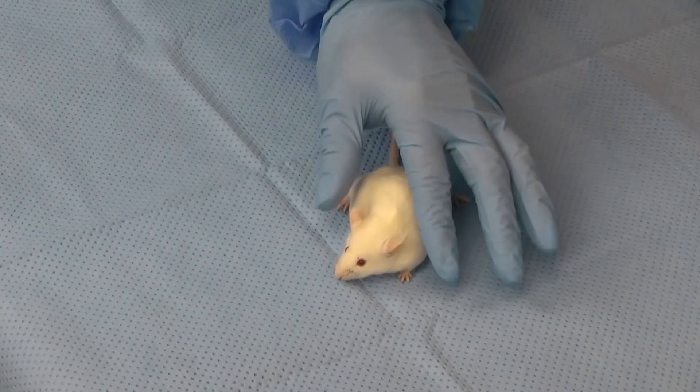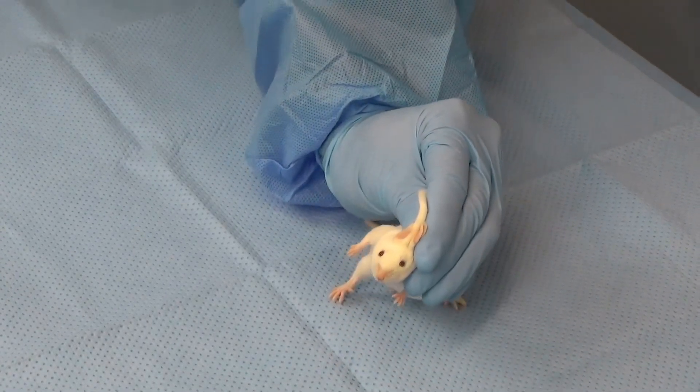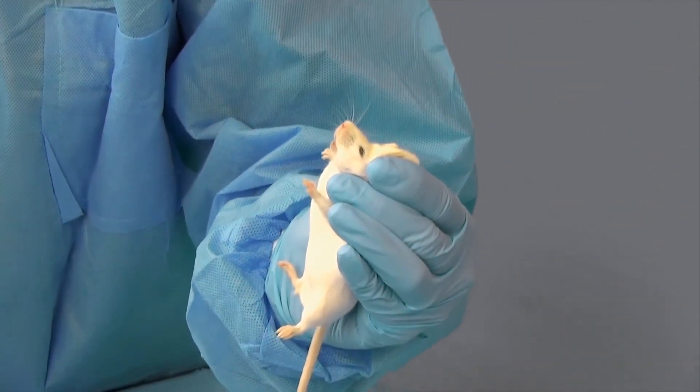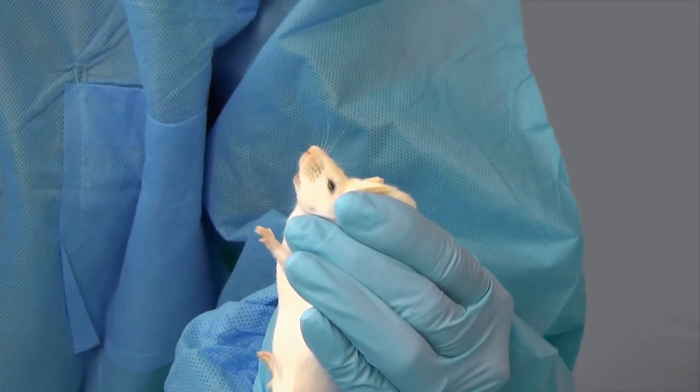Here is a third restraint technique that can be used for calmer mice. It tends to provide the least amount of stability during restraint. Again, be sure to lift the mouse off the surface so that the mouse cannot use its back legs for leverage.